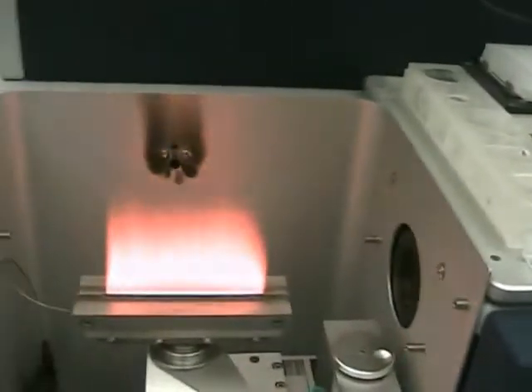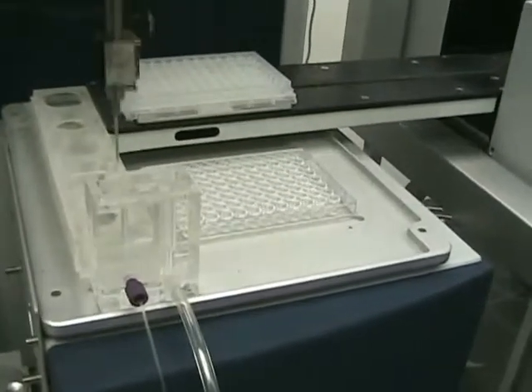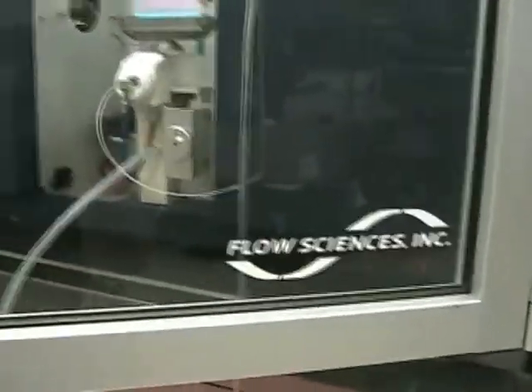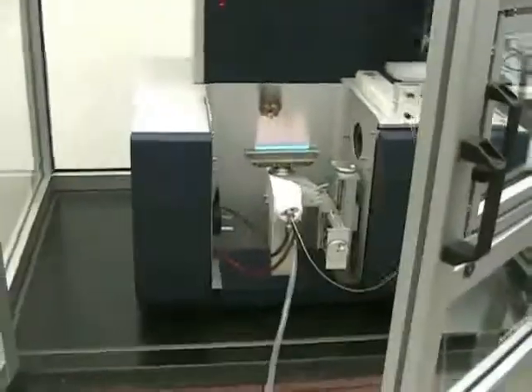We can see a beautiful flame — it's nebulizing really nicely, and that's because we have the new nebulizer in there, which gives more accurate readings. This unit doesn't have the plate stackers that mount on it, but it's pretty much turnkey other than that. The Flow Sciences fume hood is really nice — it's got an access door on the front if you want to run your microplates through the front window, though we have it running through the side which we feel is more convenient.